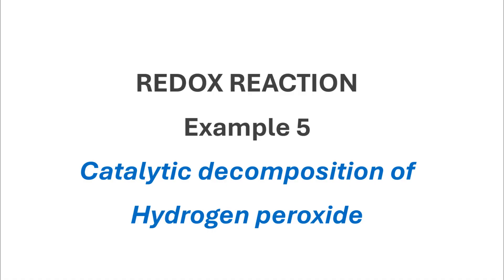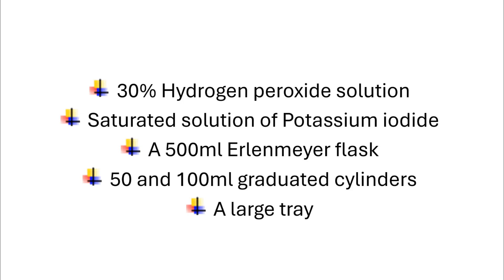To perform this experiment, you will need the following: a 30% hydrogen peroxide solution, a saturated solution of potassium iodide, a 500 ml Erlenmeyer flask, a 50 and 100 ml graduated cylinder, and a large tray.